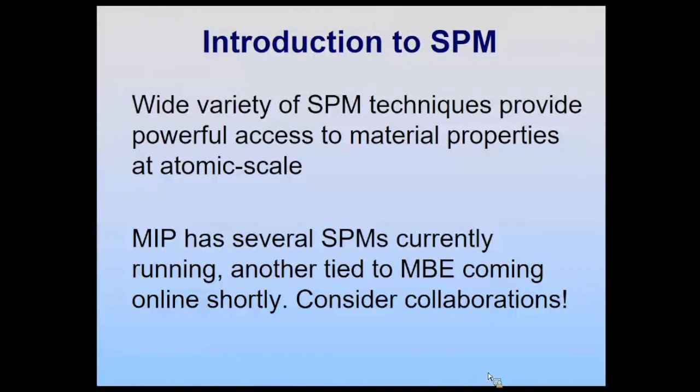So if you want to tell the charged defect from the natural one, is AFM or STM better at doing that, or TEM or STM? Repeat the question. If you want to see if you have an impurity and whether it's charged or neutral, what's the best technique for doing that? That's an interesting question.